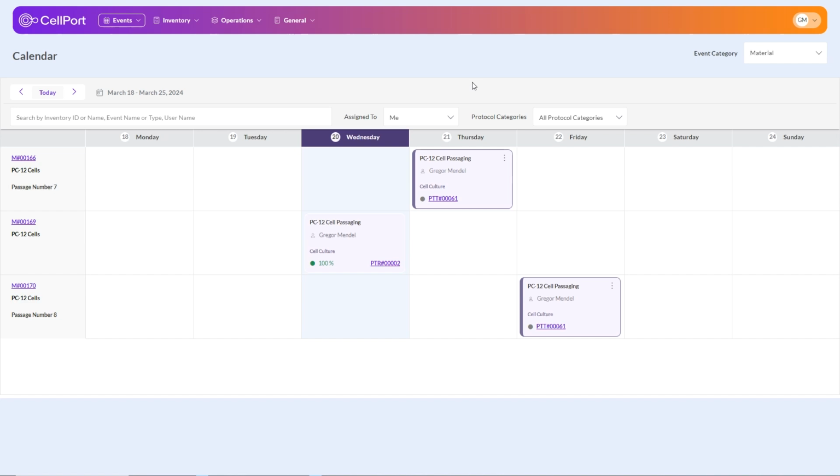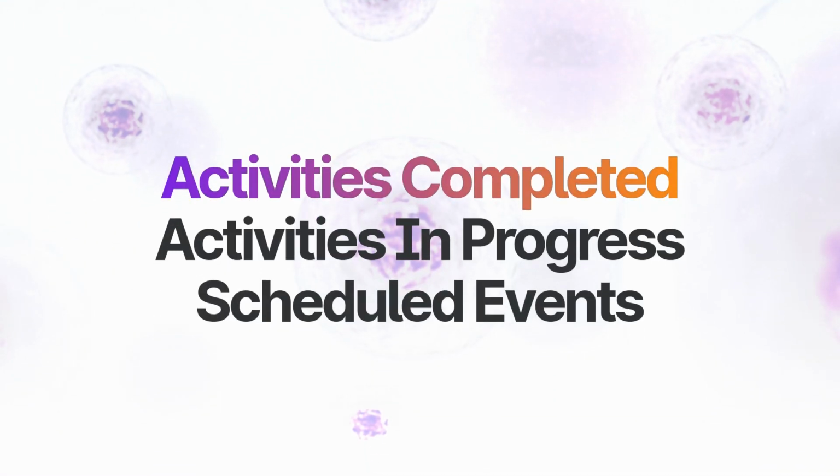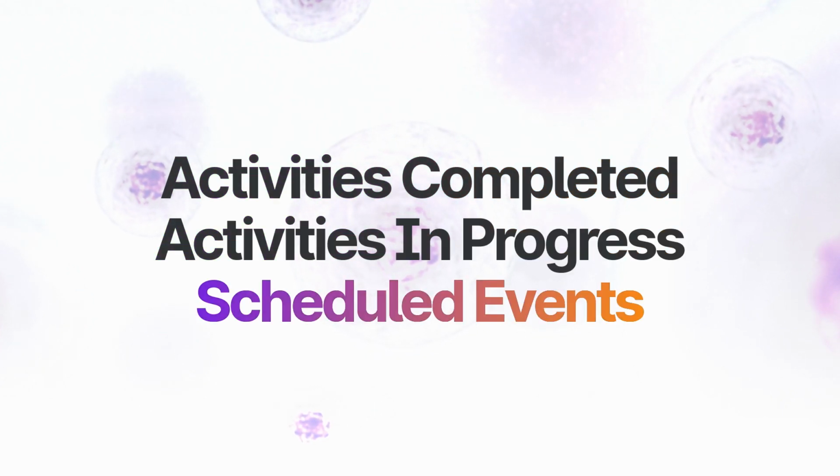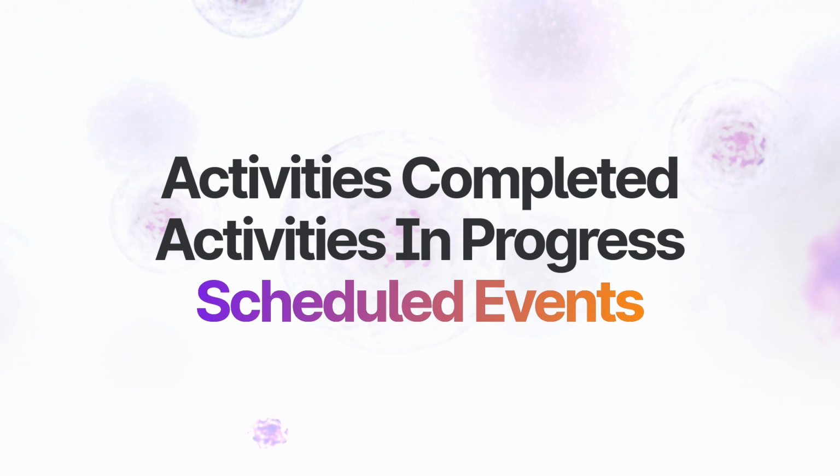We're looking at the CellPort calendar, which is how most users manage their daily cell-based operational activities. The CellPort calendar shows a day-by-day list of all the activities that you have completed, all your activities in progress, and all your scheduled events that haven't yet been started.